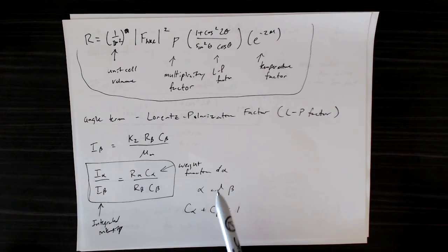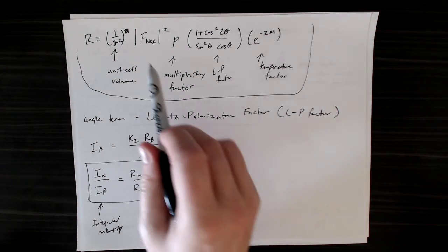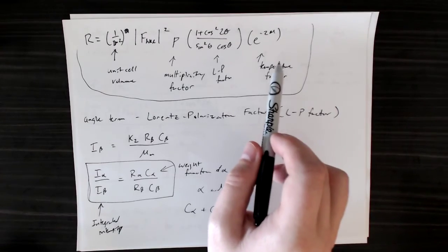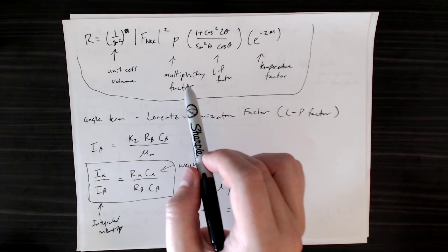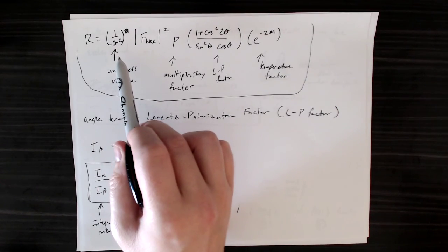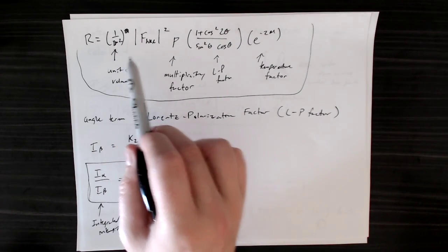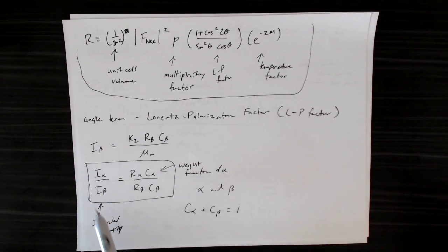I won't redo everything that I did in the last video, so if you want to know where to get these values, see the video on single phase predictions. Otherwise, the only new factor is the unit cell volume that you see here, but everything else is the same. And then you'll want to calculate these integrated intensities or areas from your peak fitting software.